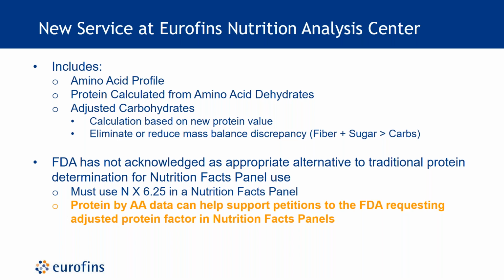Not to mention, you also have another aspect: many of these ingredients we test in the raw material form for NLEA testing, so the full nutritional profile. When those are provided or sold to finished good manufacturers and they're formulating based on an inflated protein value, you're going to cause more problems down the line. And that's going to be problematic in the long run, especially when you consider the fact that these matrices probably are not going away.